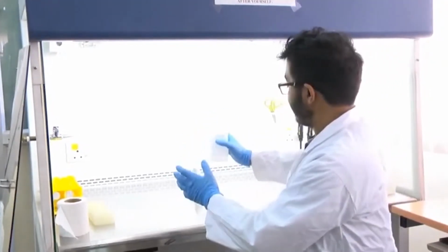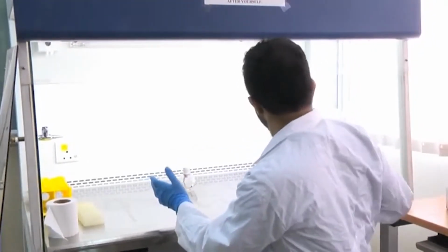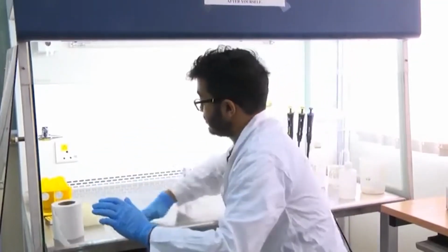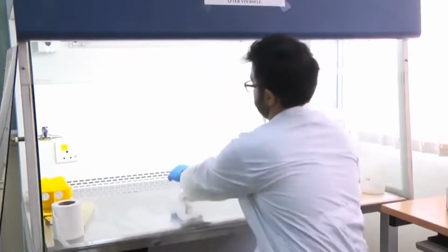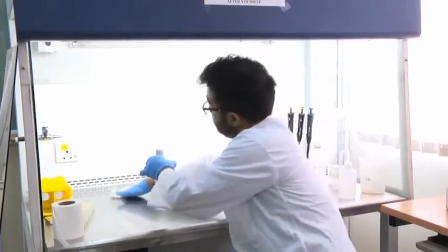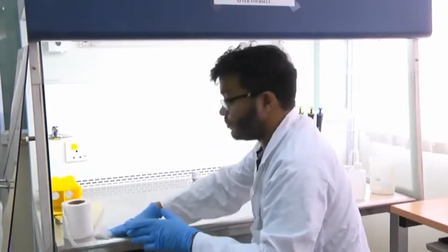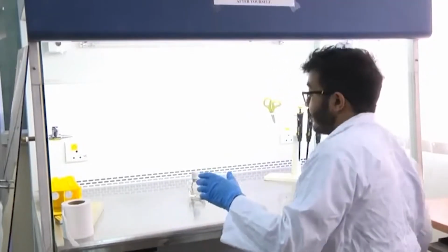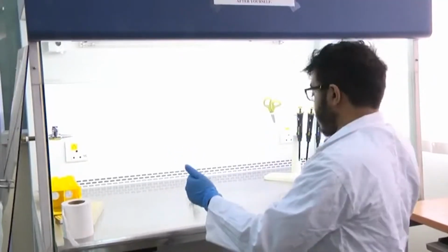What you should notice is, when I begin, I take some ethanol, spray it all over the surface and give it a nice wipe down to further sterilize the surface. I know that there is a UV lamp and it is going to keep the internal area sterile, but even beyond that, it is good practice to always wipe down the laminar airflow hood with 70% ethanol before you begin your work. And also after your work, you should wipe it again so that the next person gets a very sterile place to work in.